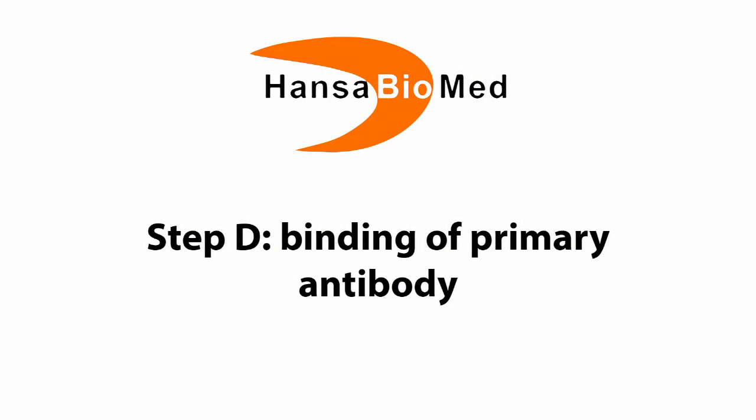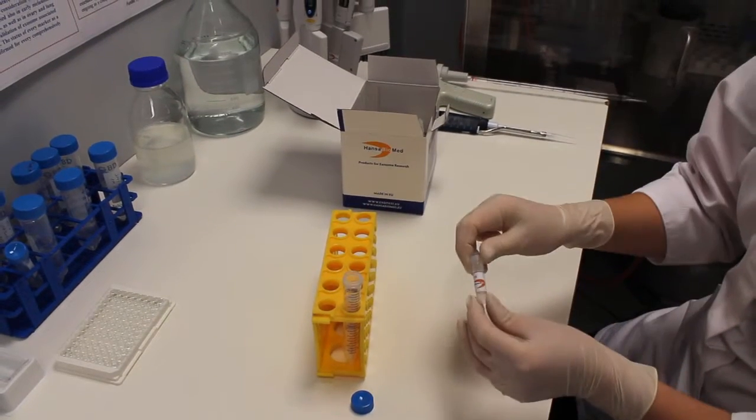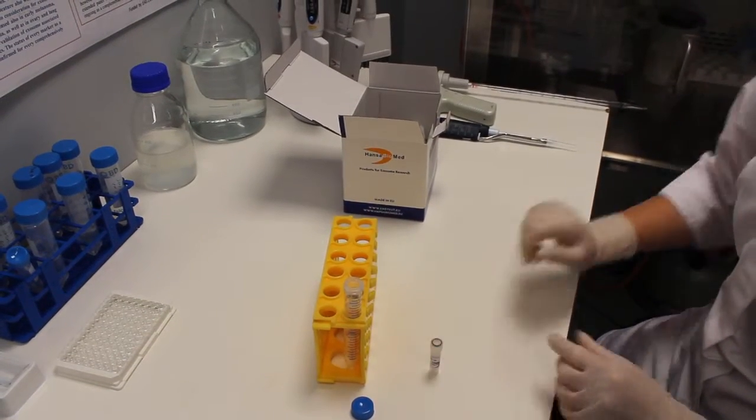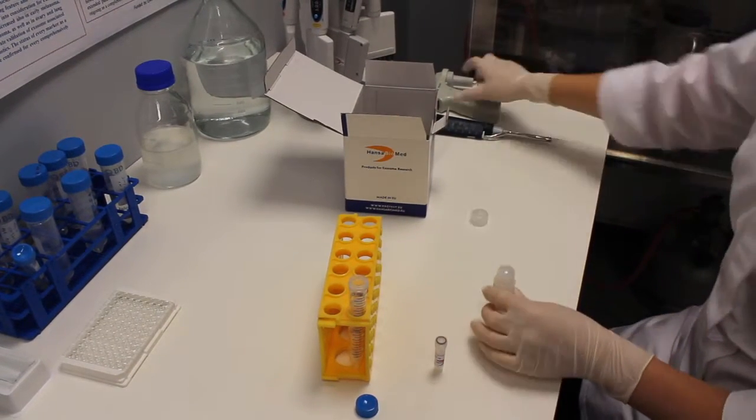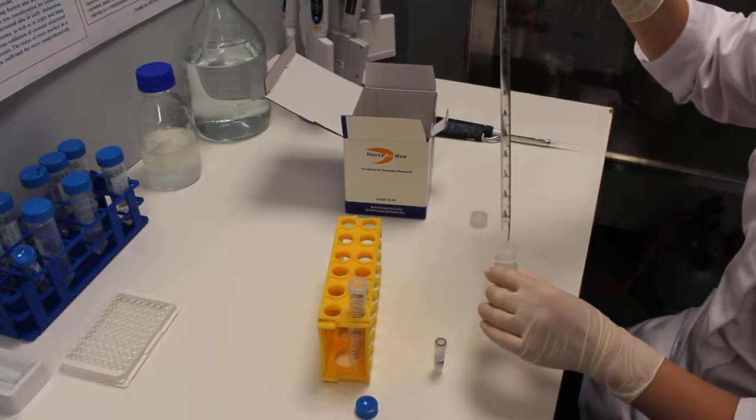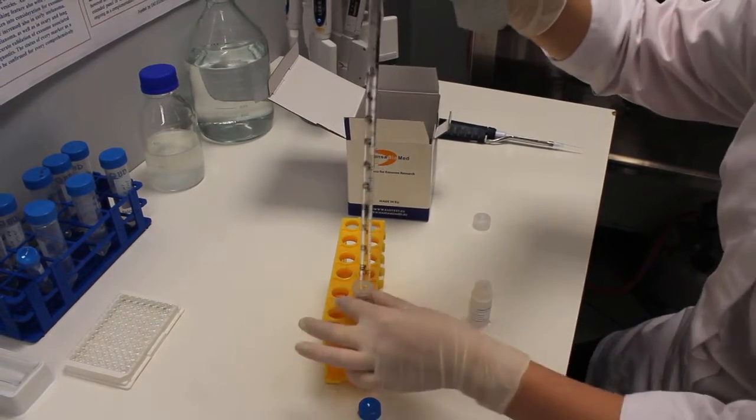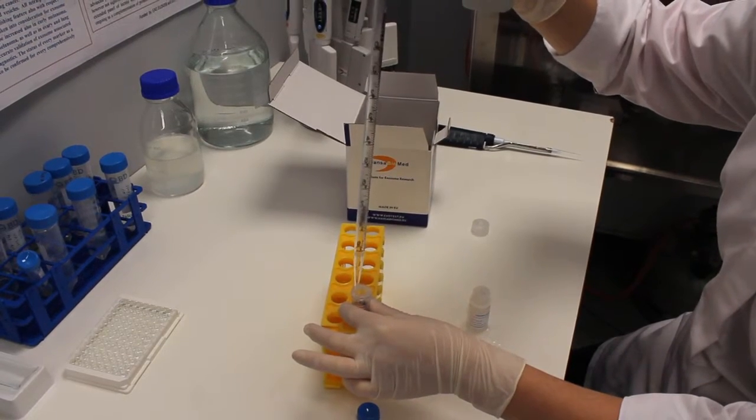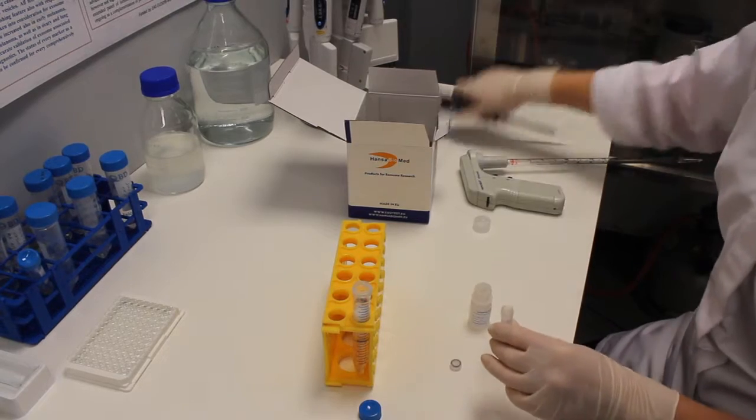Step D: Binding of primary antibody. We need to dilute primary antibody 500 times. To do this, we take 10 ml of sample buffer and add 20 microliters of primary antibody.